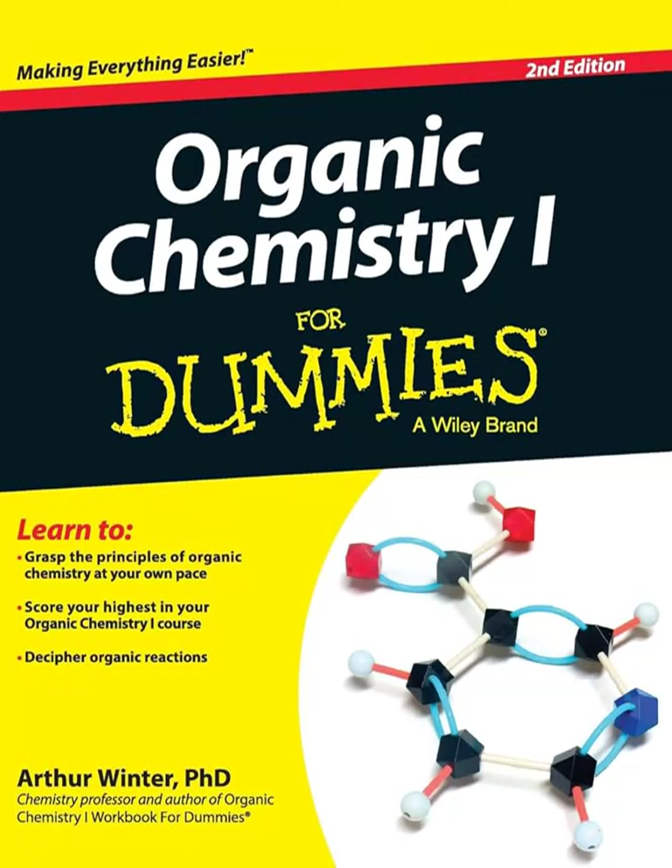Welcome to the Deep Dive, where we transform complex information into clear, compelling insights, really cutting straight to the most important nuggets of knowledge. That's the plan. Today, we're embarking on a fascinating journey into the world of infrared spectroscopy, or IR. That's right. Our mission for this deep dive is to equip you with the understanding of how this powerful analytical tool actually functions, and what it uniquely reveals about a molecule's structure.